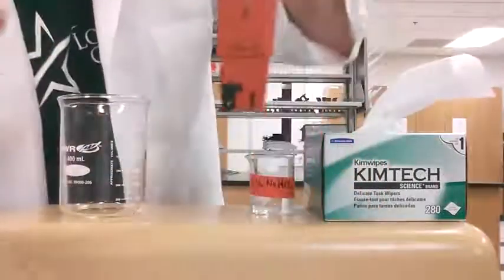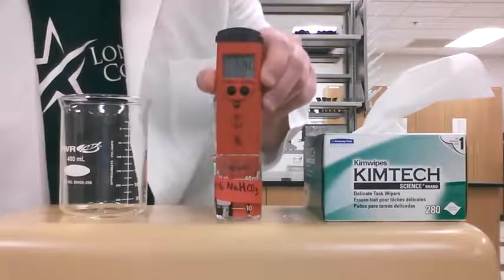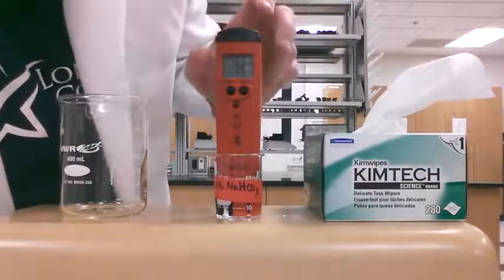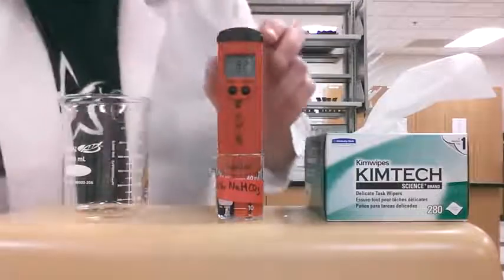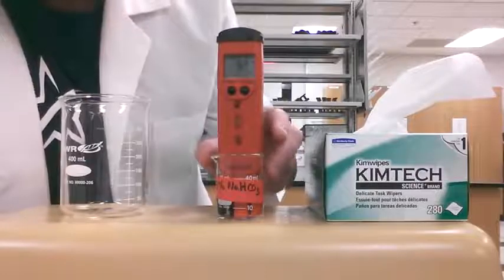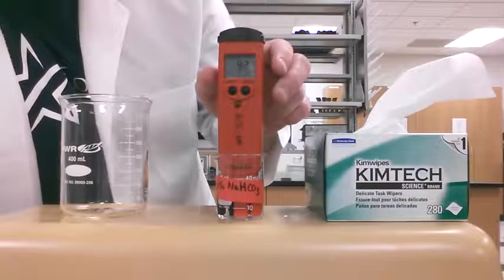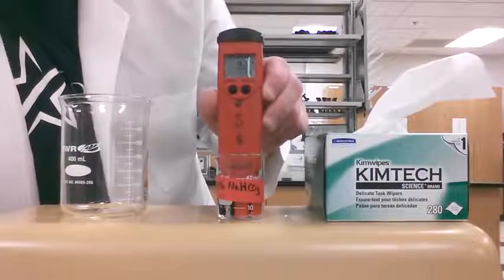Immediately you're going to see a pH reading. Take the pH meter and put it into your solution — that's going to give you your pH reading. Here we have a 9.27 reading for the pH, which is about right because sodium bicarbonate is a slightly basic solution.